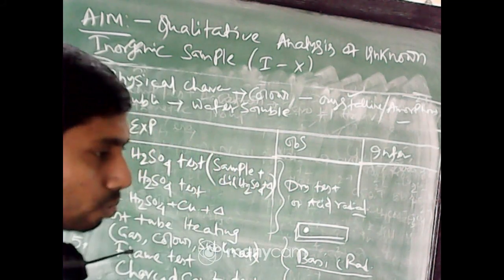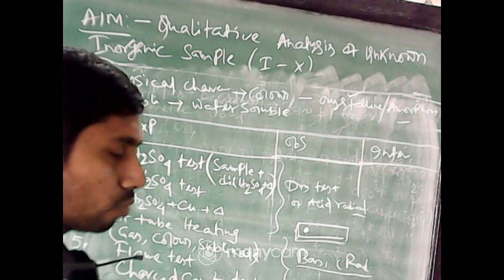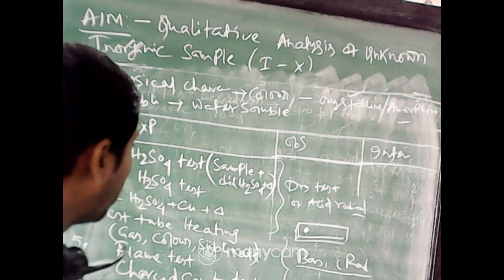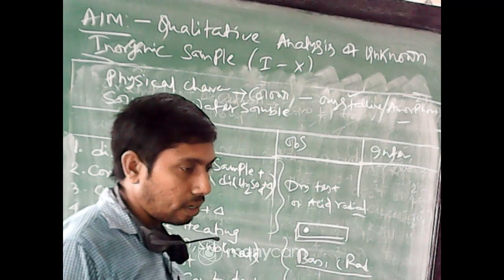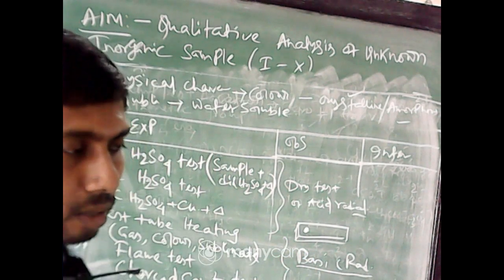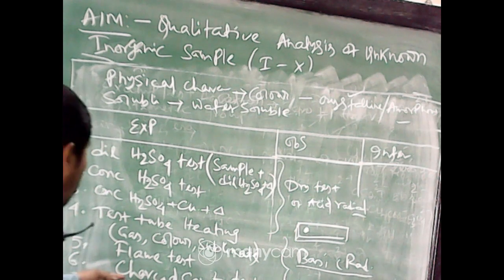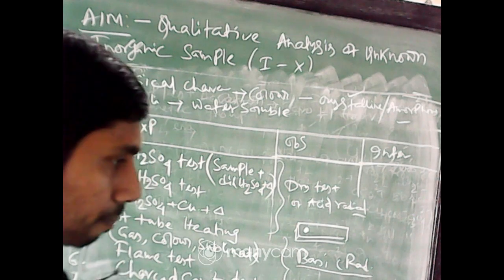Then it will reduce and give a color. This color is important to us. So this is the charcoal cavity test, which is also called the cobalt nitrate test. When you add 1 drop of cobalt nitrate on this hot sample after heating, it will turn a bluish color. This indicates that aluminium is present here. For this, look at the charcoal cavity test experiment in the given PDF.